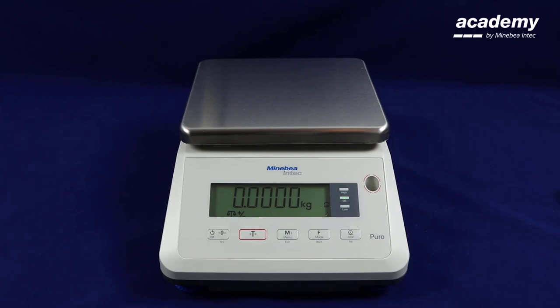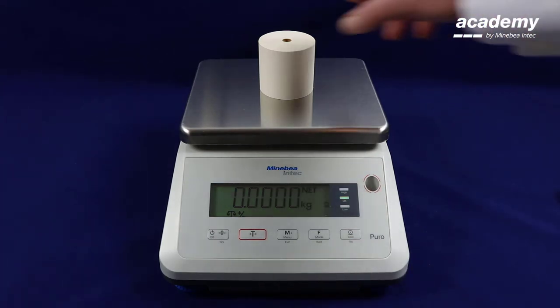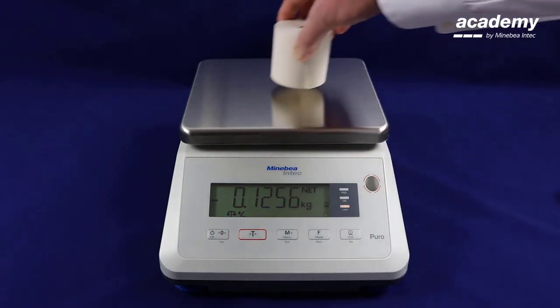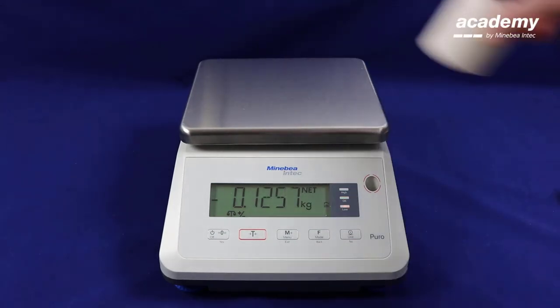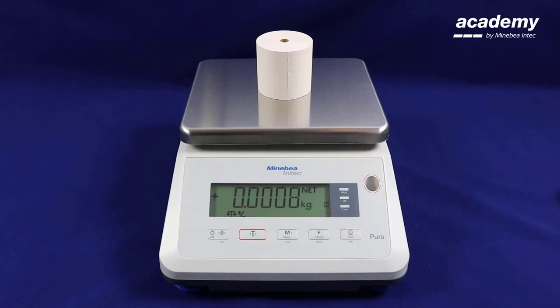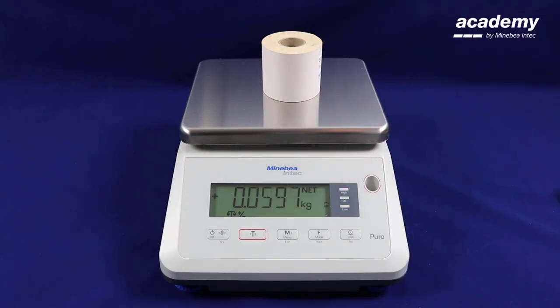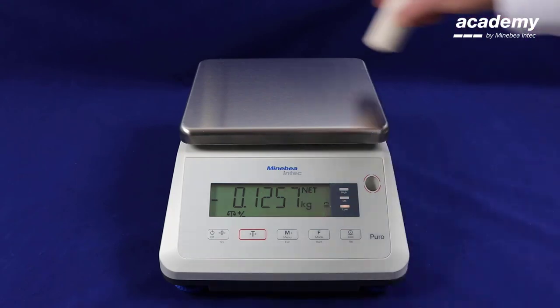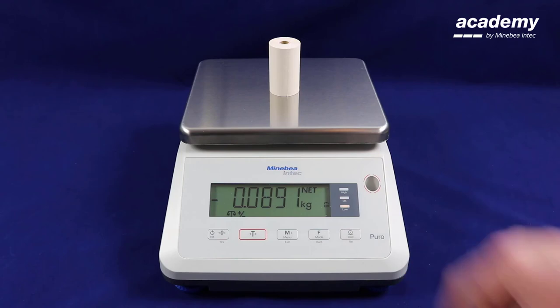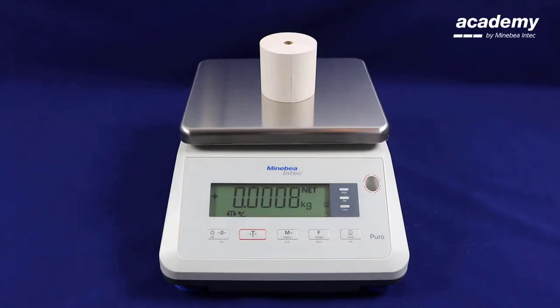Now you are in the zero check weighing function. Your first sample is your reference sample. Place it on top of the weighing pan and press tear. All subsequent weighing samples will be compared to this good sample. As you can see the light is green — this is a good sample. Likewise this is also a good sample. The check weighing light has gone red and therefore it is not a good sample. This sample is too low. Ending on a good sample.